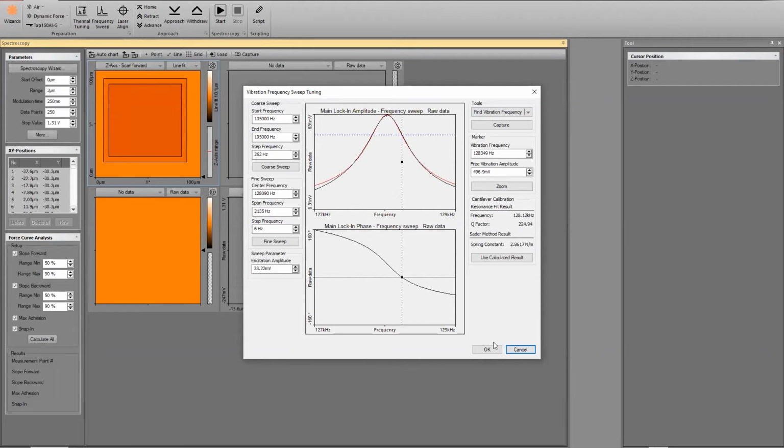Right, thank you. And with Core AFM and FlexAFM, you can do the spectroscopy on samples in liquid, which is not possible with Nano AFM, Nanite or Lens AFM. Okay, so it's best to discuss with us which system to use depending on your application.